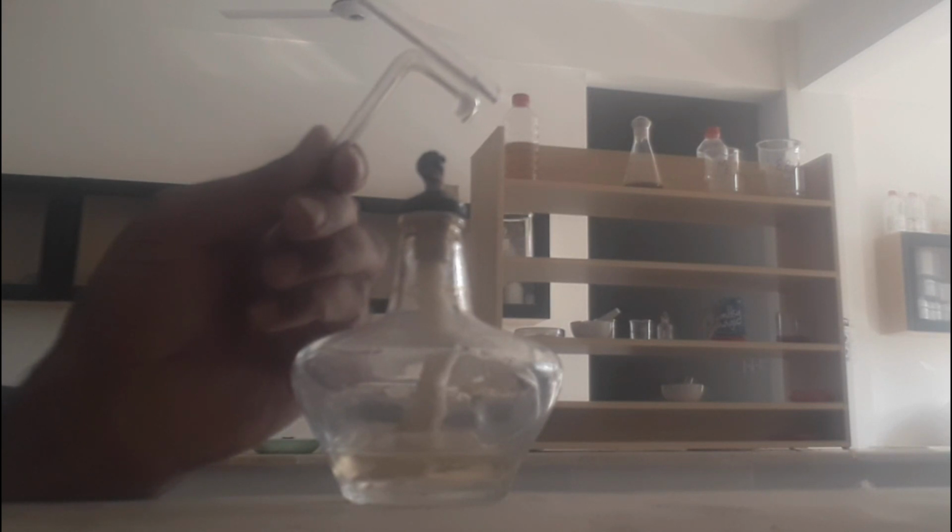Creating your own spreader allows for unparalleled precision. You're not only customizing it to your exact needs, but you're also being resourceful and cost-effective in the process. And there you have it, your very own handcrafted L-shaped cell spreader, tailored precisely to your lab's needs.